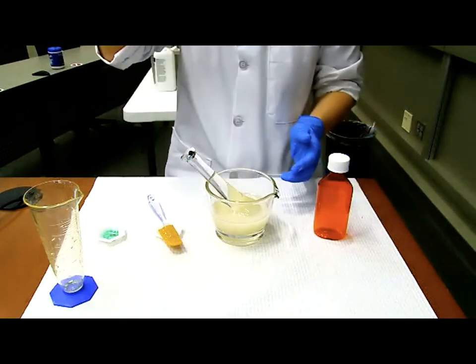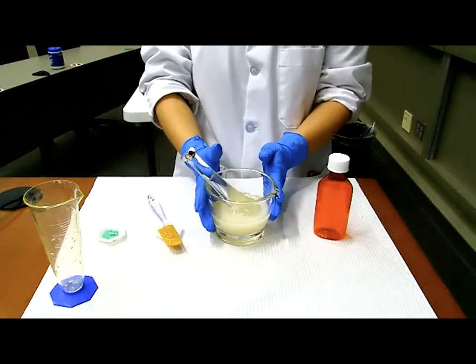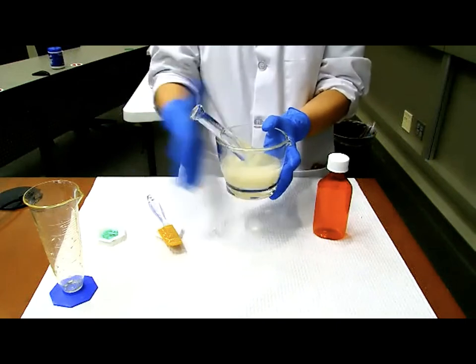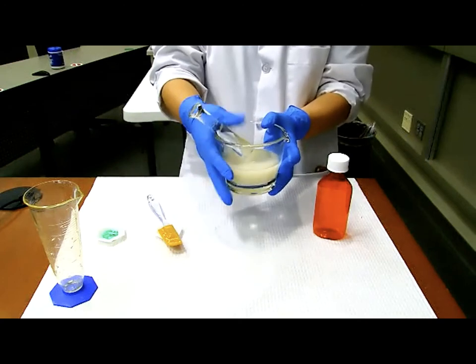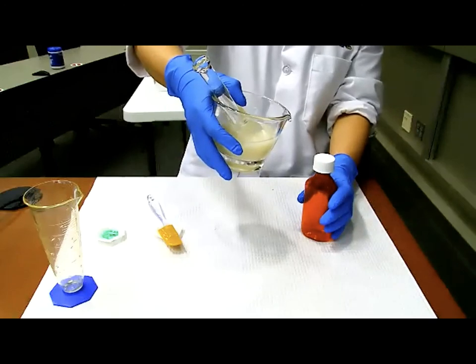So pay attention. I want to show you the proper way of holding the mortar and pestle together to be transferred. Your thumb will actually stabilize the mortar, and then your palm will hold on to the pestle. So this is the proper way of transferring into the bottle, okay?